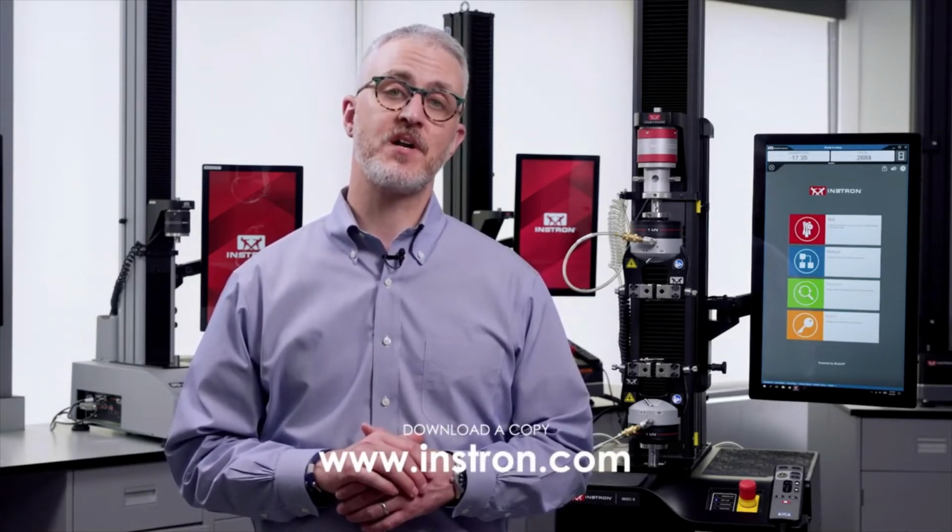Before you move on to actual testing, please make sure you consult your lab manager for detailed instructions on how you should be setting up and running your material or product tests. For more information about the specific system in your lab, I recommend reviewing the operator guide that came with the frame. You can also download a copy from Instron.com.